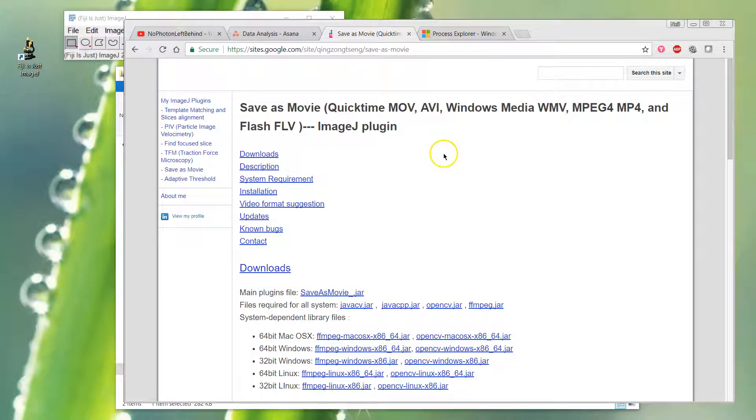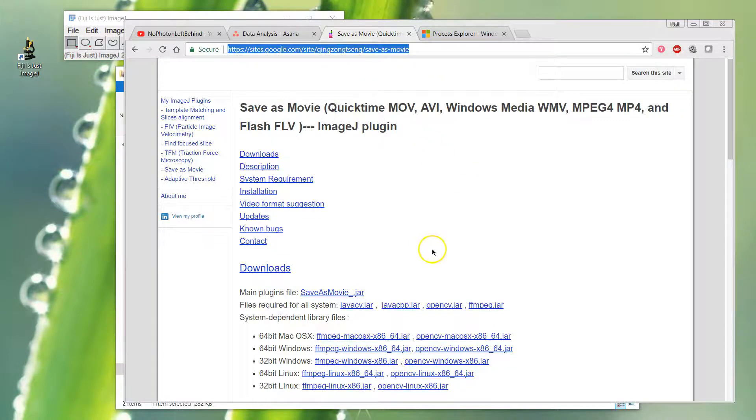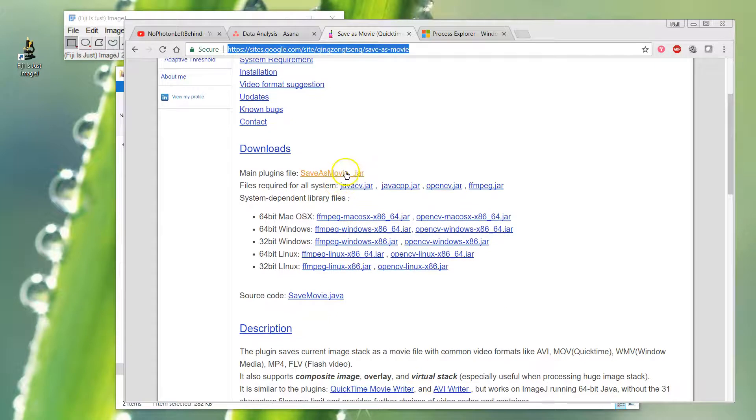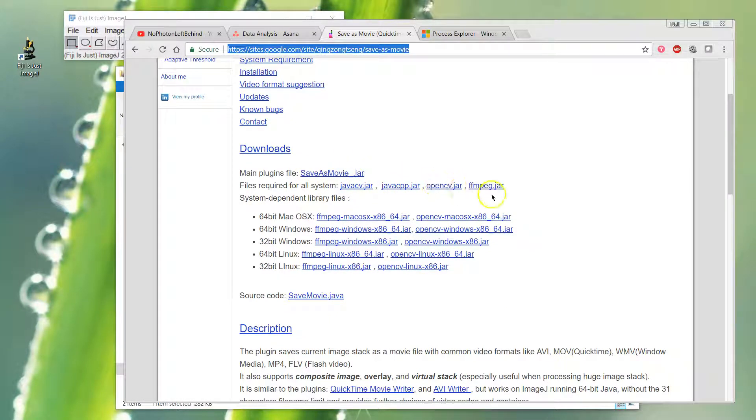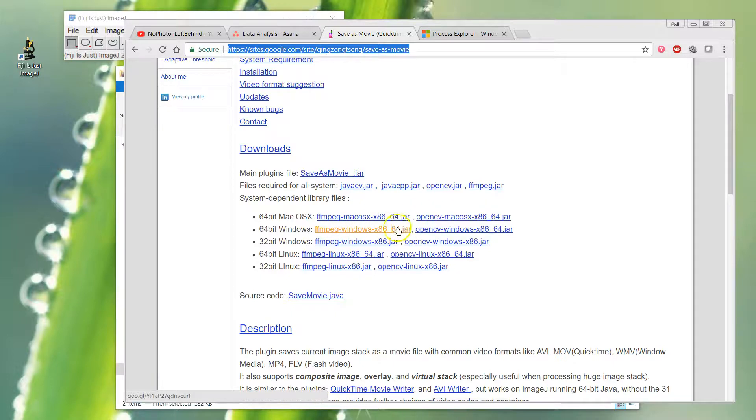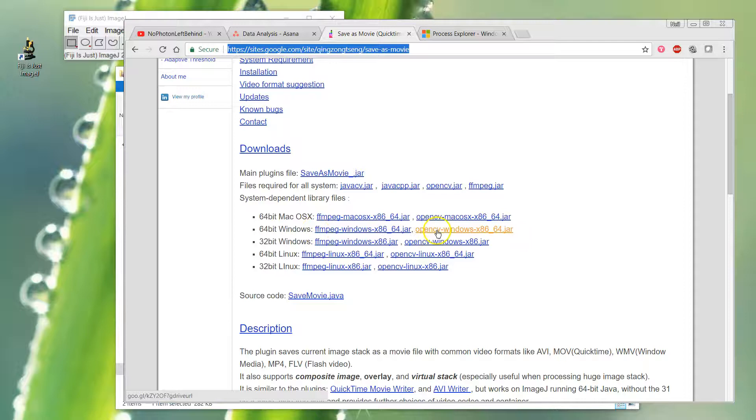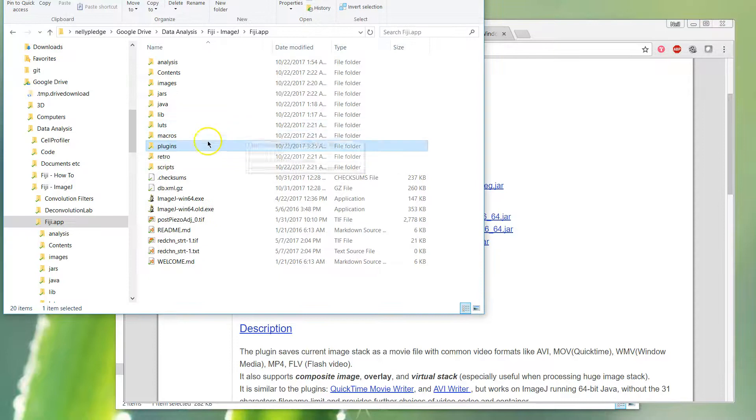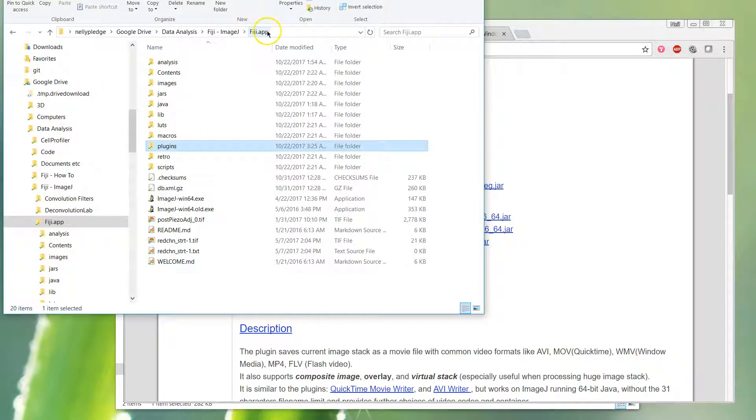I've had more success with this set of downloads for a plugin called Save as Movie. I'll put the link in the bottom. You need to download the main jar file, all of these different combinations - these four here - and then the pairs you need here for your different OS. Whichever OS you've got, get that one and that one.